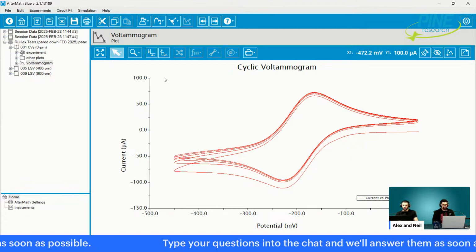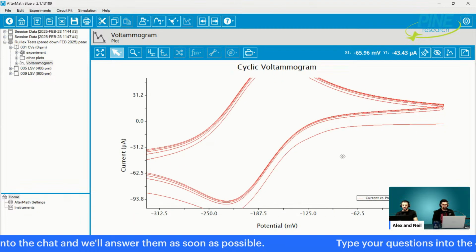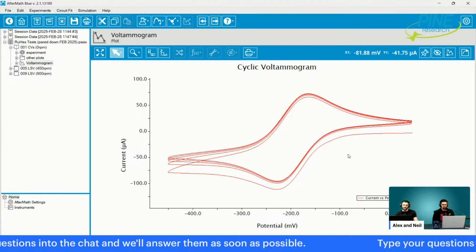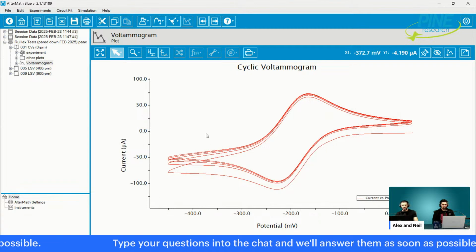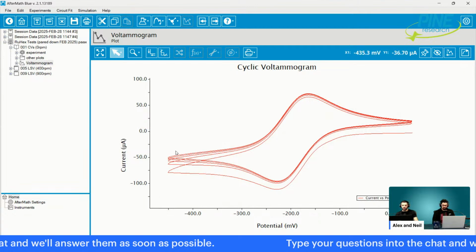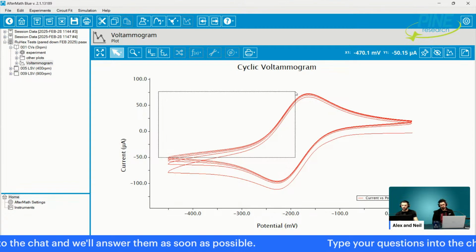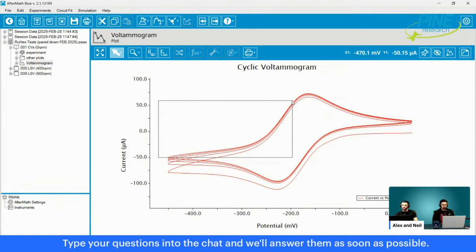My impression of your question, Dooley's, or to anyone who's looking at foot of wave stuff, is that it kind of looks at, for example, in this voltammogram, not all of these data are kinetic data. And to make a Tafel plot, you must have kinetic data. But what we do is we can say with some level of accuracy, where the current is flat and then it starts to go up exponentially, that's roughly the kinetic response. That's roughly kinetic data. That's dictated mostly by the Butler-Volmer equation.